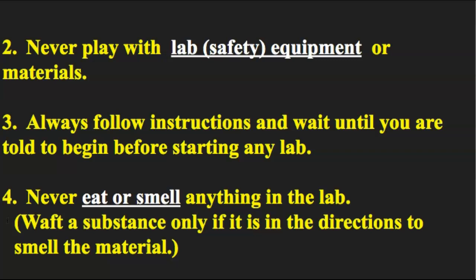Otherwise, you should not intentionally try to deeply inhale and smell any chemicals in the room. If you do need to waft something, you hold it away from your body with one hand and you gently fan it towards yourself with another hand while inhaling. And that'll give you the general idea of what the smell of the item is.